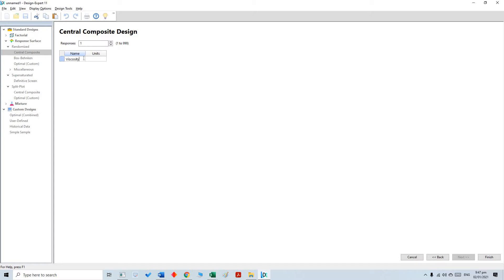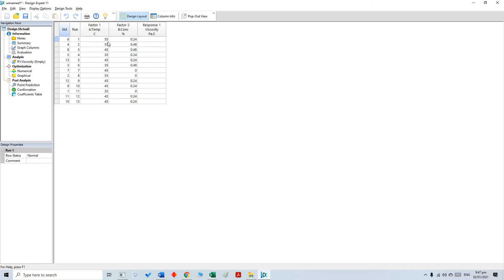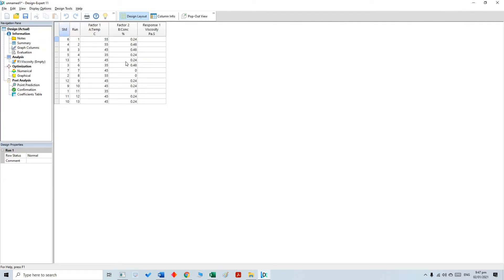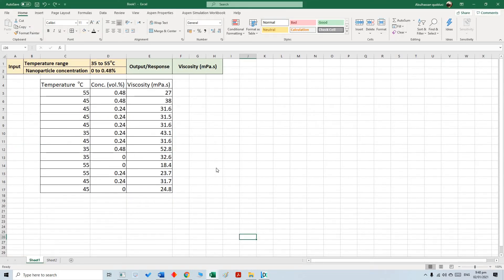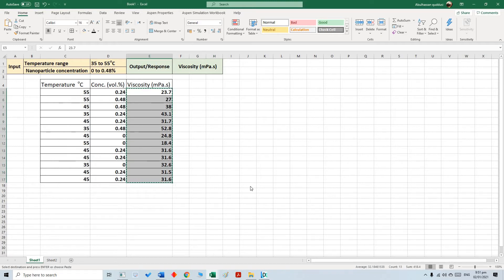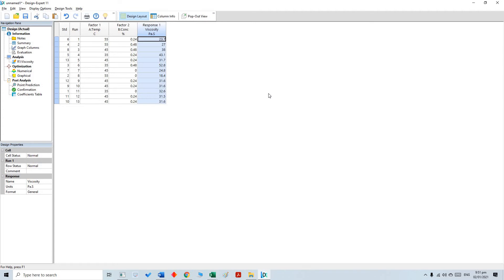We write viscosity here and now click the finish button. Once we click finish, it gives us a design matrix. We need to actually conduct the experiments and put the viscosity results here from the experimental data. I already have this result, so I just need to rearrange and fill up the table by copying and pasting these values. Now our table is finished and we are going to move to the analysis part.